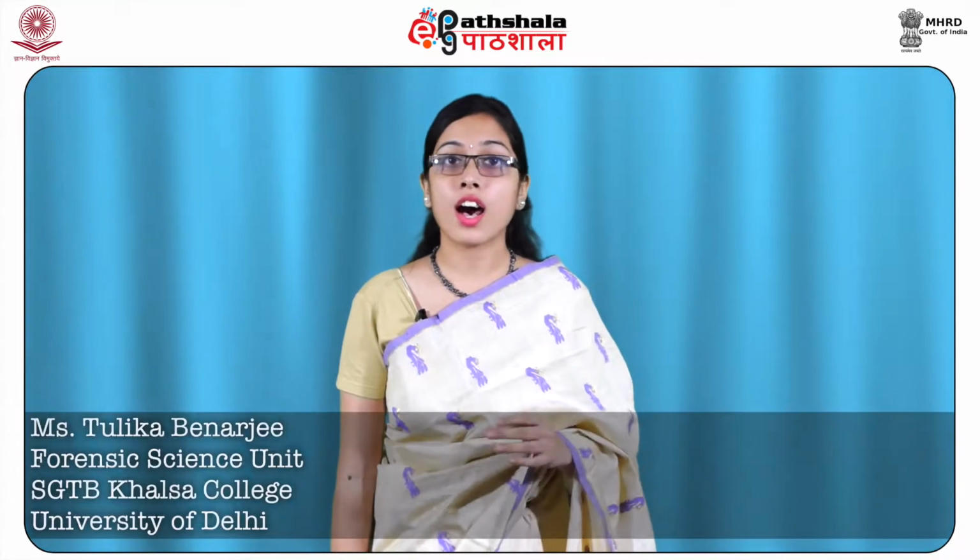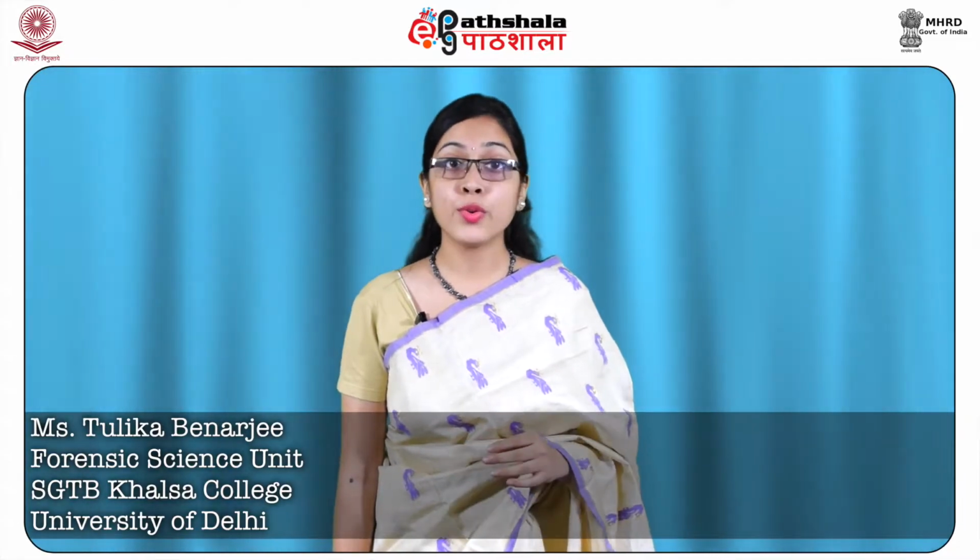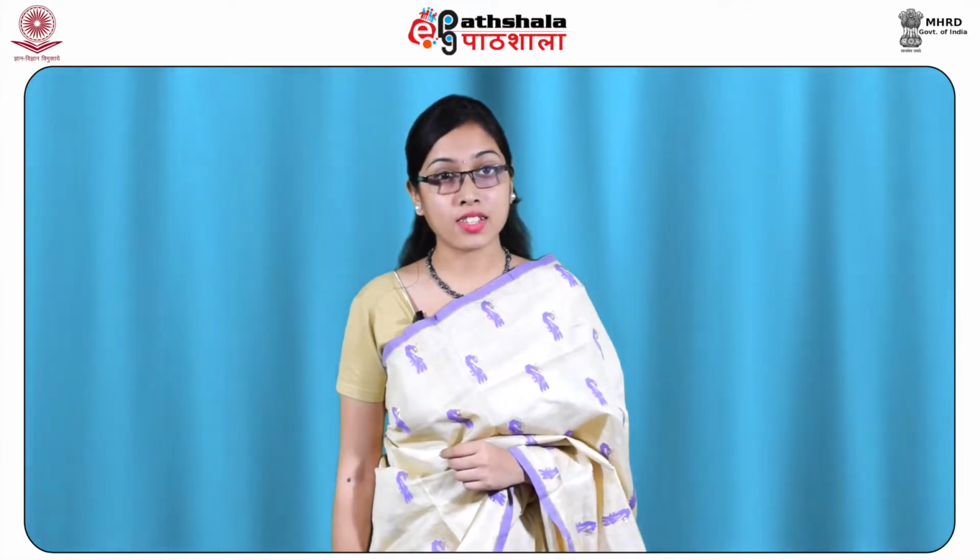Dear students, after studying this module, you shall be able to know about principles of chromatography, types of chromatography, theoretical principles underlying chromatographic techniques, and qualitative and quantitative analysis by chromatography.